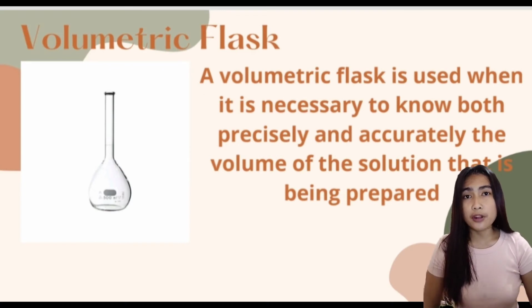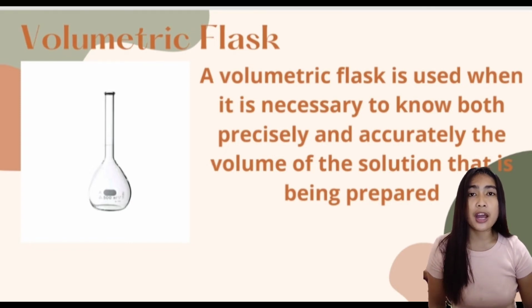Next is the volumetric flask. A volumetric flask is used when it is necessary to know both precisely and accurately the volume of the solution that is being prepared.